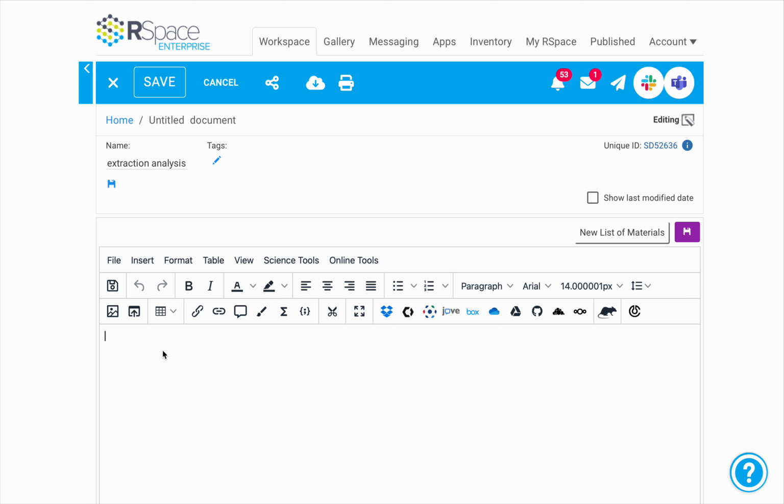In the text of my basic document, I'll say something like, here is the trend I see in my data.